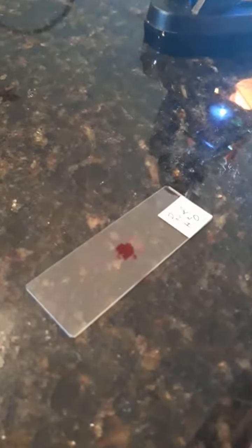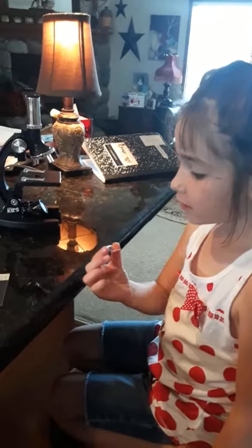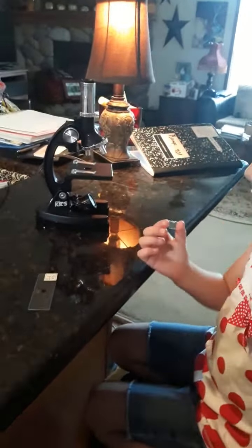We put the dye on it and we're just waiting for it to dry. We have to put a cover on it to finish our slide so we can look through it from the microscope.